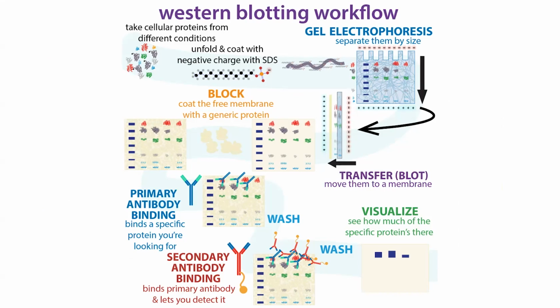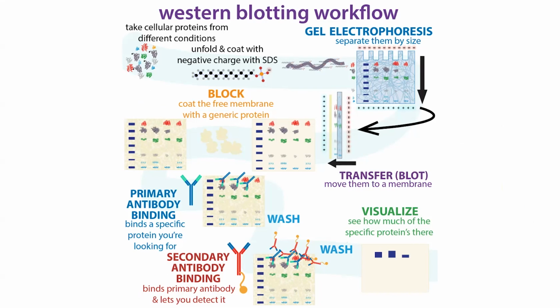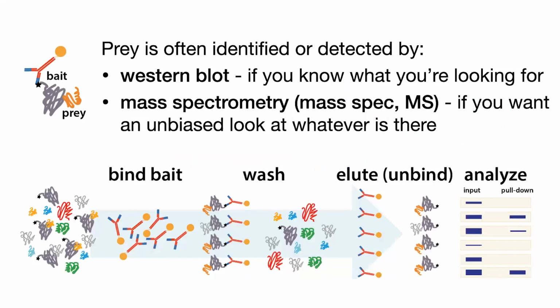The way that a Western blot works, you're only probing for specific things, whatever the antibody that you're using is probing for. And remember, these are the prey antibodies and not the bait antibodies, although you also do a bait antibody just to test and see your efficiency, and we'll get more into this sort of thing. But here, basically, you need to know what you want to look for. So you're not going to be able to detect any binding partners, any prey that you don't know going in could be prey, and therefore don't test for.